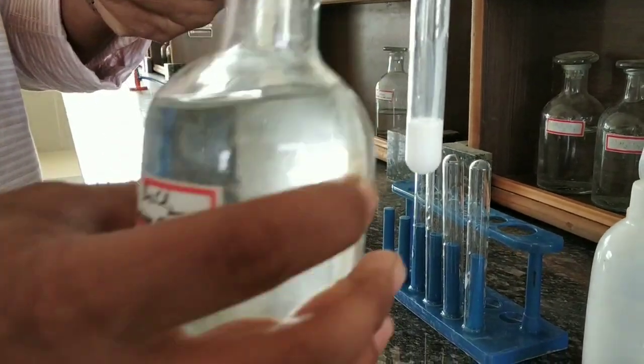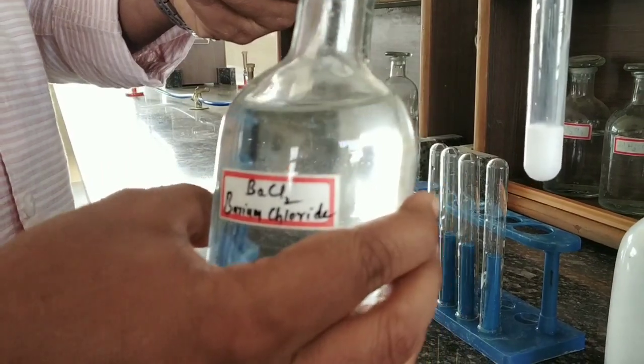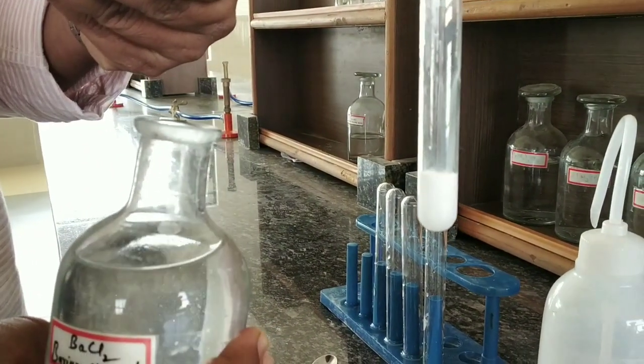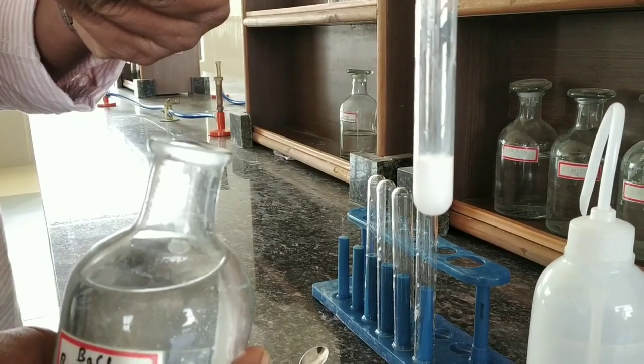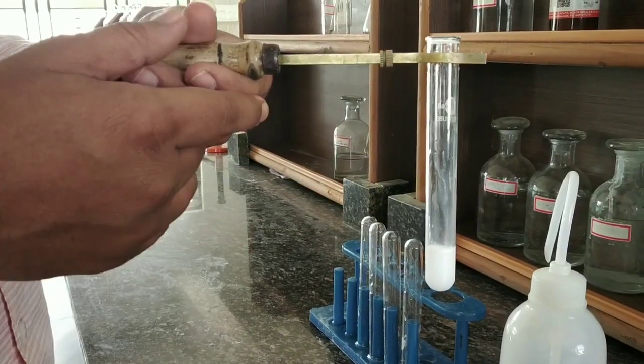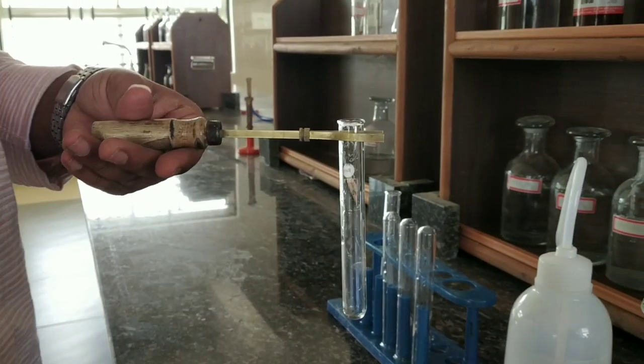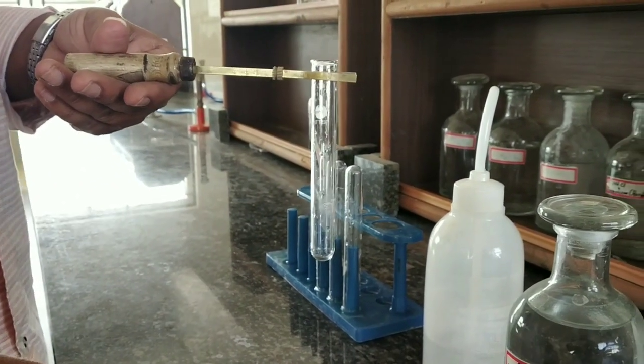The formation of white precipitate tells us that when barium chloride is added to the given salt, which contains sulfate ion, this barium chloride turns into barium sulfate. This indicates the presence of sulfate ion.